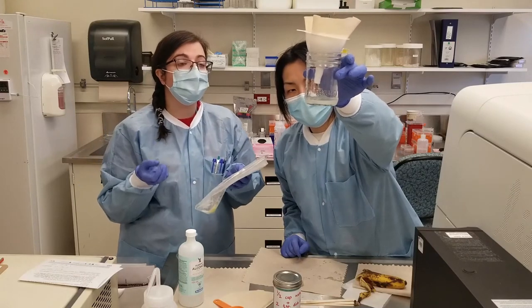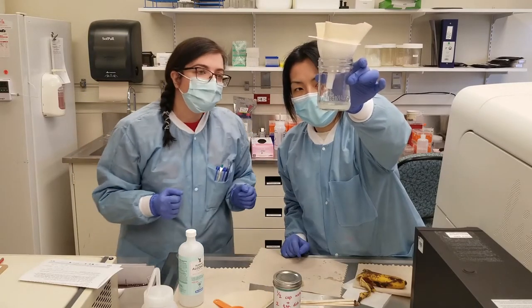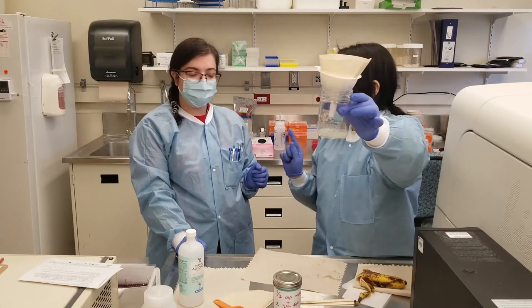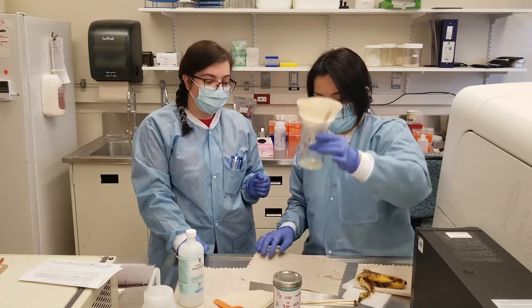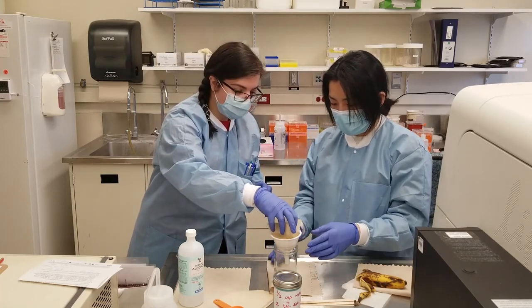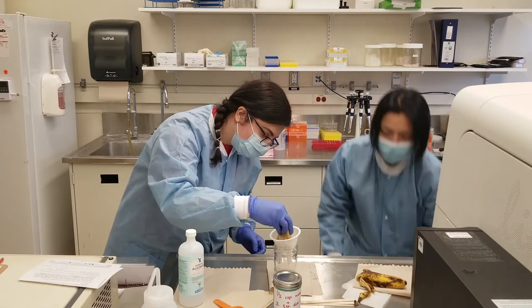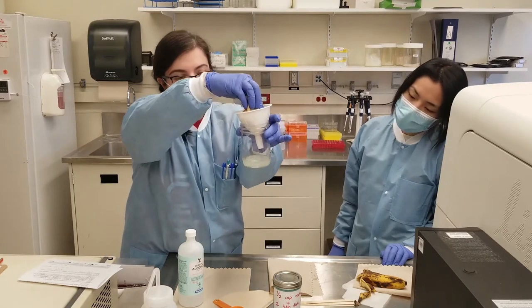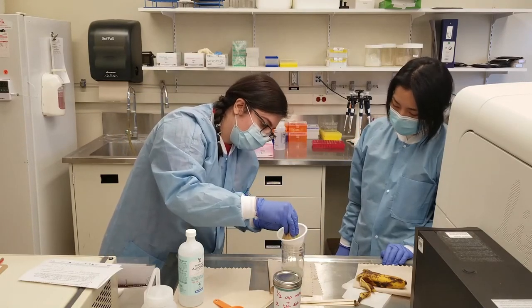So you should be able to precipitate the DNA out of the solution using the ice-cold ethanol that we have in the freezer. DNA is soluble in water but not soluble in alcohol, and that's what causes it to precipitate. You can gently squeeze the coffee filter, but try not to break it. I'm squeezing it gently from the top to help push the liquid through.